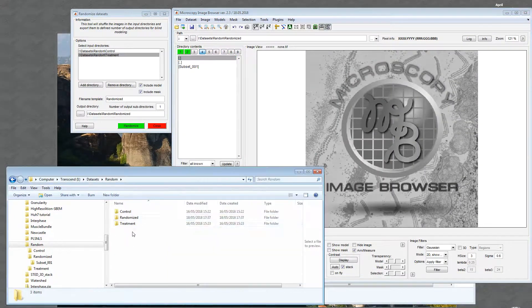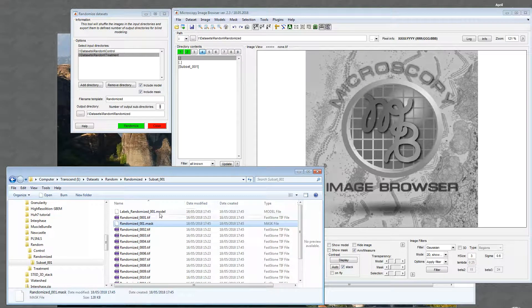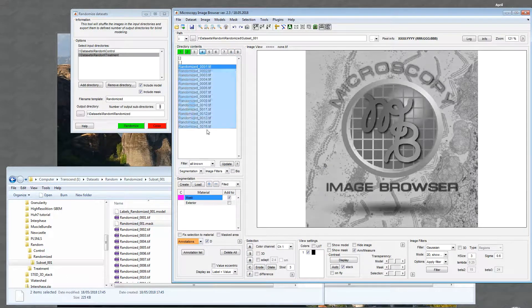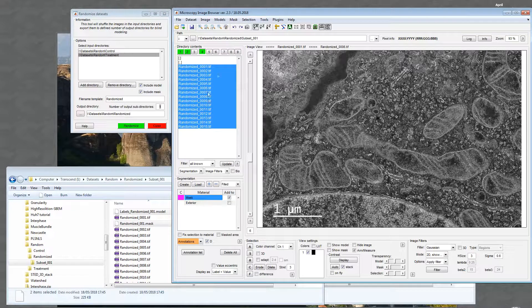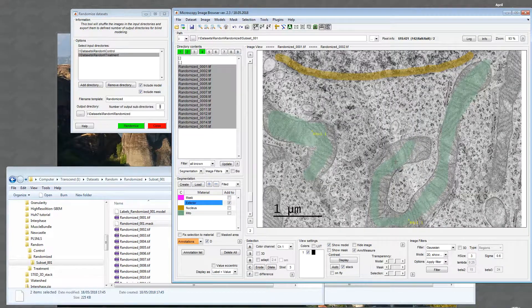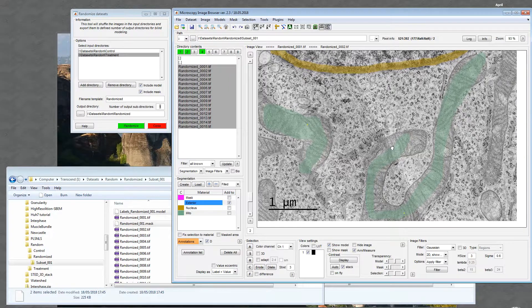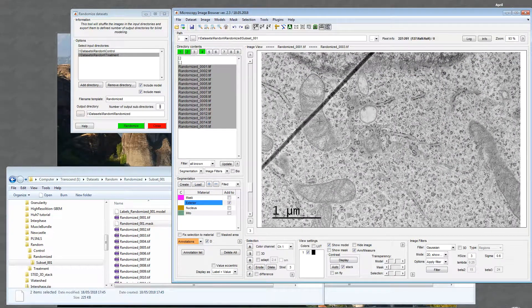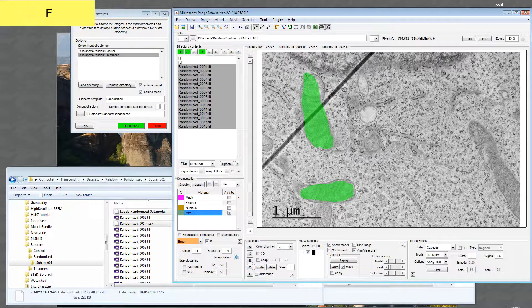Now in the randomized folder I have only one subset, since I specified one subfolder, with all the files plus the mask and model combined. The files are randomly placed in the list. I load the model and it corresponds to the actual dataset from which it came. I can continue segmenting — for example, I'll draw a few more mitochondria on this slice — one, two, three — and save.